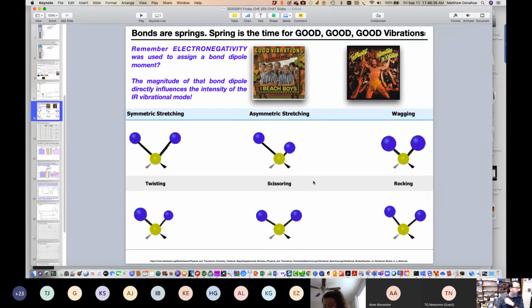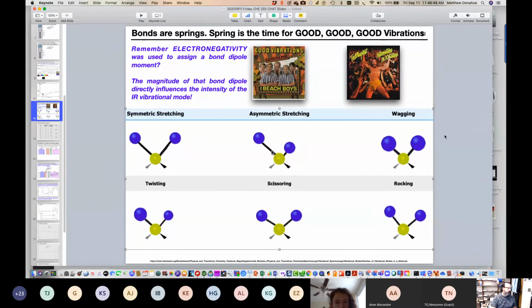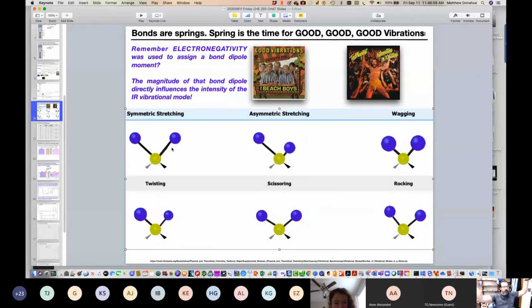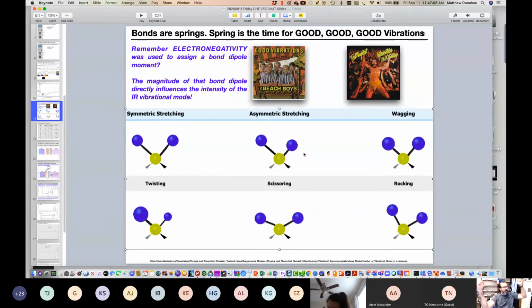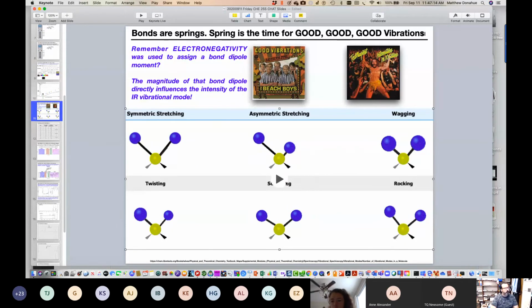So I'm going to play you a little movie here. Hopefully you can see it. So when we're looking at IR spectrum, these are the different modes of vibrations that occur. So there's symmetric stretching. I've been sitting on my keister for a couple hours now. I want to stretch. Symmetrically stretching now. So if I do this, Frank the Tank, this is asymmetric stretching. I'm in the mosh pit. Now I'm wagging. Both are moving.